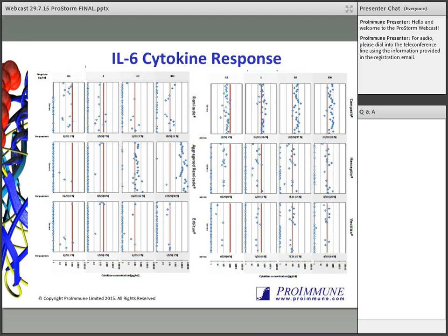As for the test articles, the upper left set of graphs is Remicade, which we've just gone over in the previous slide, and beneath that is aggregated Remicade. So there's very little activation occurring at the 2 lower doses, but as soon as you get to 10 micrograms per ml, it's really in the same level or ballpark as Campath. So you can see that the innate immune system can really respond to aggregation and recognize aggregated proteins as a risk factor, which suggests that the quality of the drug is quite important, but also the mode of delivery.